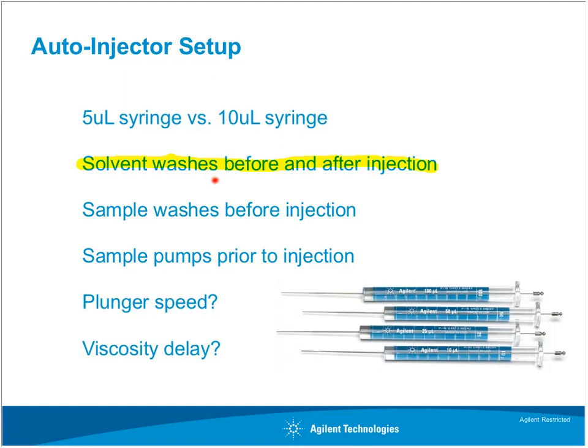With our autosampler, you have a wash A and a wash B. Oftentimes, if you have issues with sticky plungers and really gummy samples that tend to give you issues after a while, choosing a different solvent for wash A, which is typically what the system is going to hit first, versus your sample solvent, which is what you'd really want to use in your wash B, or the last solvent that your syringe is going to hit, is going to be really important in making sure that you rinse out all those residues and, again, make your system a little bit more robust, get rid of that particular issue.